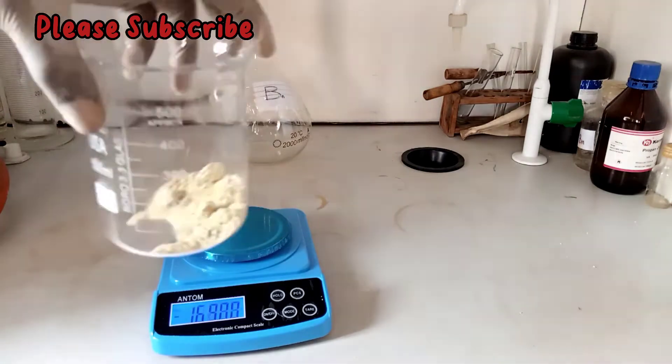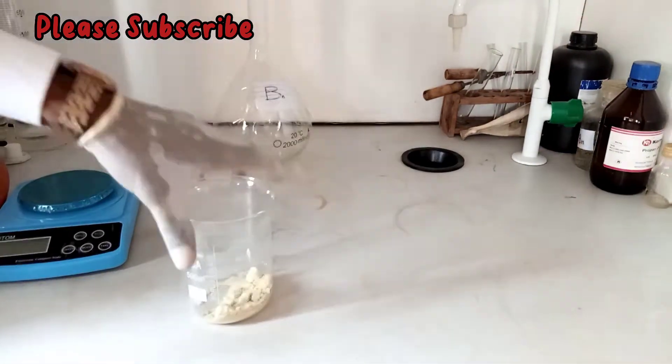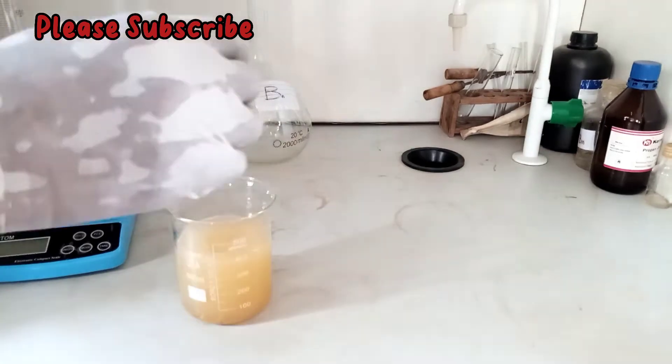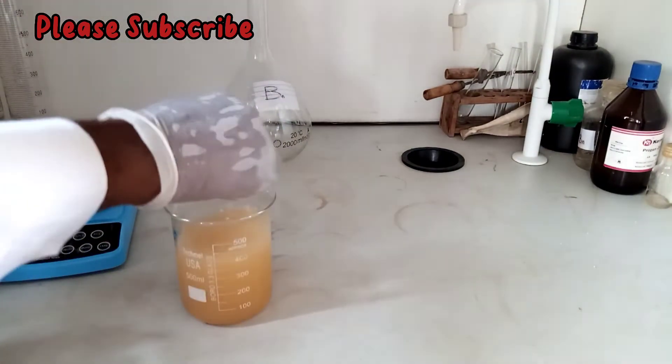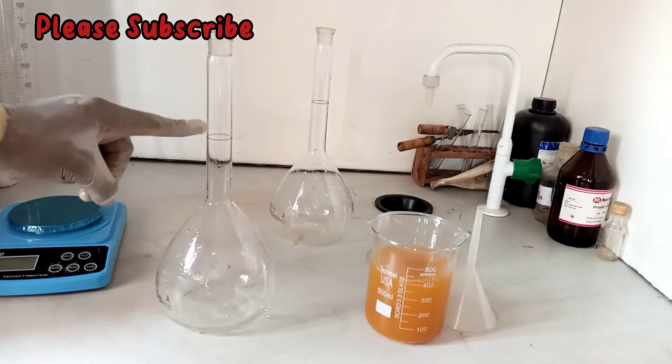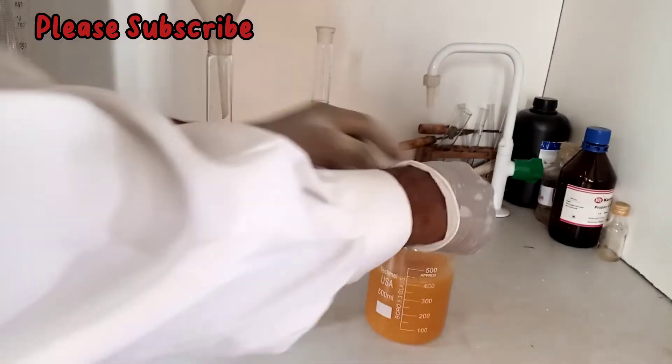This is 27.80 grams of iron sulfate. Then you dissolve in distilled water. You add distilled water to it. You stir properly to ensure all particles dissolve in it, and then you dilute to 1000 cm³ with distilled water.